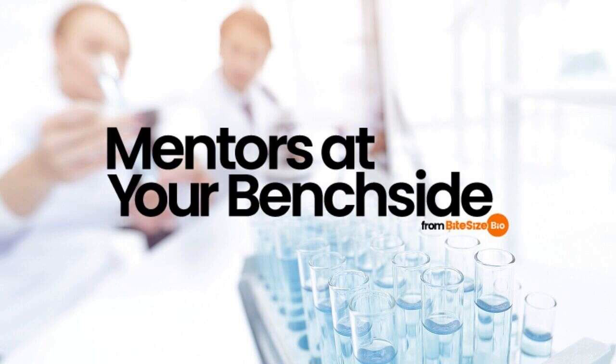Number 3, absorption control. This is the control where you incubate your sample with an immune-depleted primary antibody. It demonstrates the specificity of your primary antibody, and you should see no signal from the immune-depleted primary antibody. Immune-depleted antibodies may be produced by overnight incubation of the antibody at 4 degrees centigrade with an excess of the immunogen. Although highly recommended, this control is not as popular due to limitations in obtaining purified antigens/immunogens. This control is more reliable when the immunogen is a peptide rather than a protein.